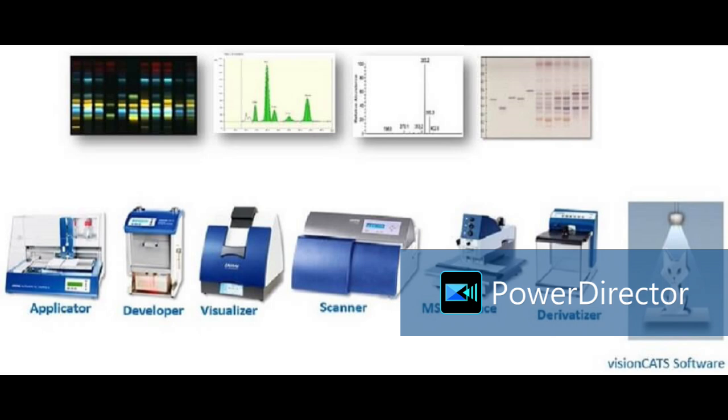For distance to solvent level, we can maintain 10, 20, 30 mm, or we can run 70 mm, but 70 mm is optimized as per guidelines. Then the developing distance is 7 cm. Chamber saturation: we have to saturate the chamber with the vapors of the mobile phase before plate development, exactly at 33% as per USP for botanical origin material. We maintain 33% relative humidity and a chamber saturation time of 20 minutes for optimized results.